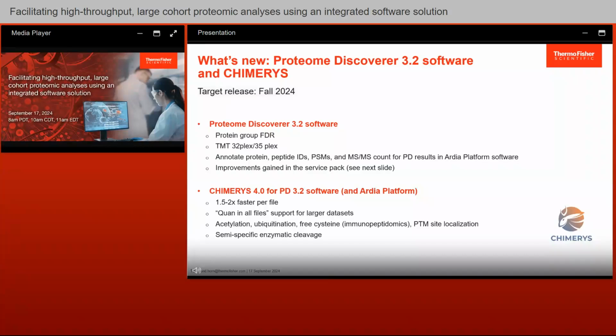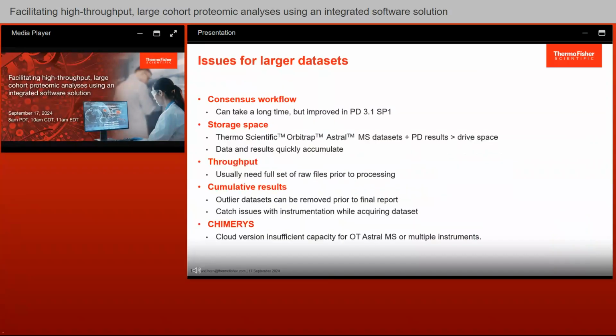While I hope I've shown that the Proteome Discoverer software is a powerful and flexible platform for proteomics applications, there are some limitations to standalone PD when dataset complexity increases. PD is designed for installation on a local PC, with the subsequent limitations of storage space and computing capacity. As datasets are readily eclipsing 1 terabyte in size, hard drive space is increasingly becoming a limitation for local software.